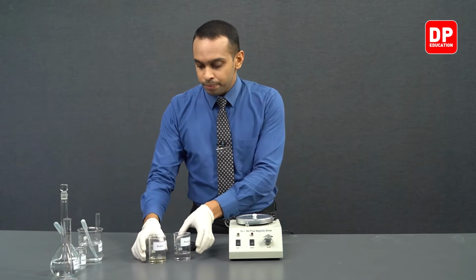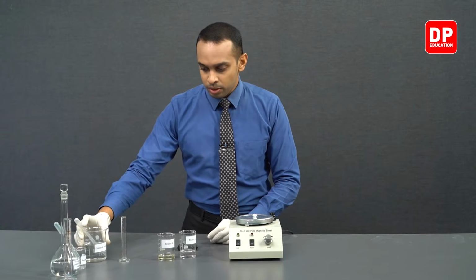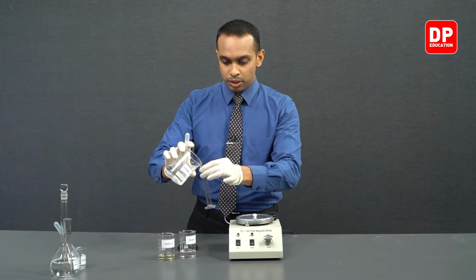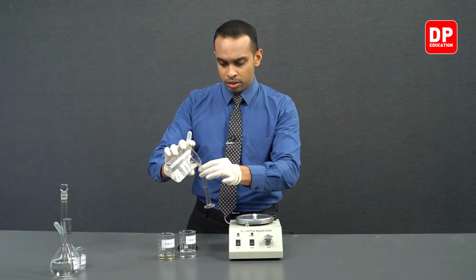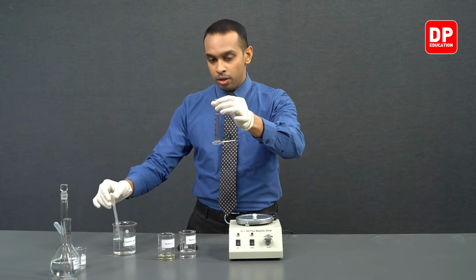And we have measured 10 cubic centimeters of distilled water. So we have a measuring cylinder here. Let's measure 10 cubic centimeters of distilled water. And I want you to know why we measure 10 cubic centimeters of distilled water.